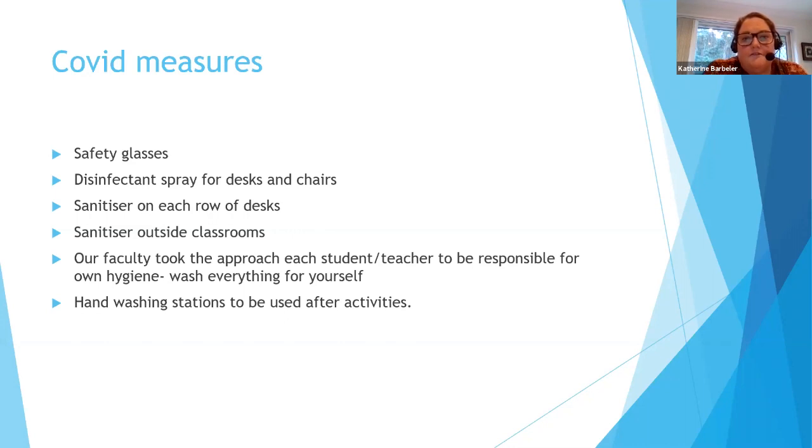So that's one of the main things. In terms of major risks in schools, there have been instances of bad accidents, but most of the accidents are topical burns or students spilling chemicals on their hands, and their hands are washed. Their burns are treated with normal first aid.